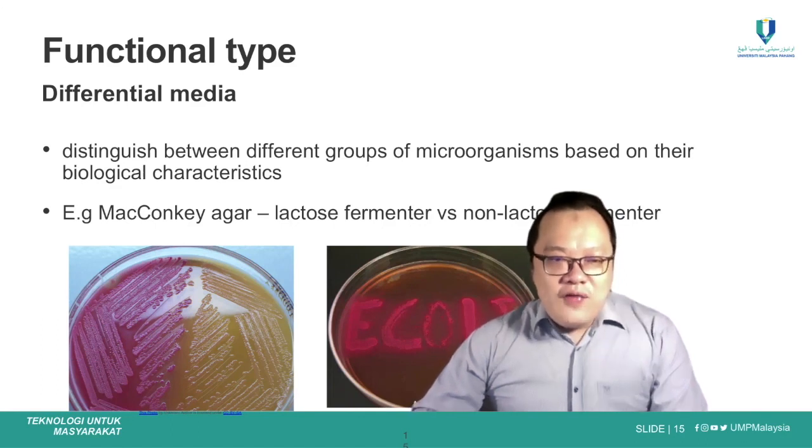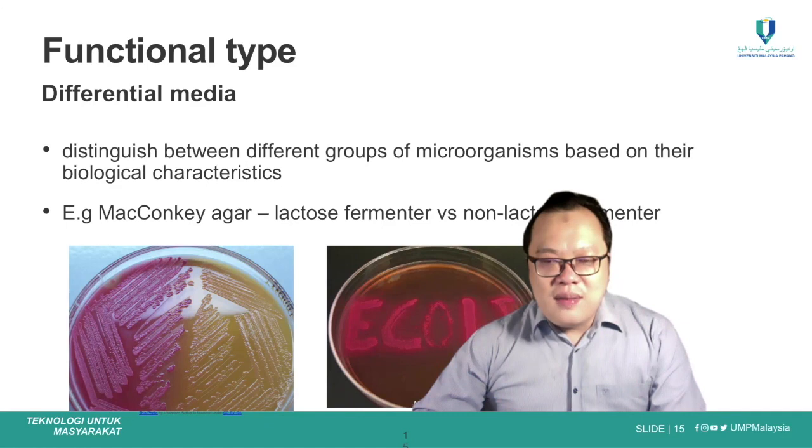The function of differential media is to distinguish between different groups of bacteria or fungi based on their biological characteristics.